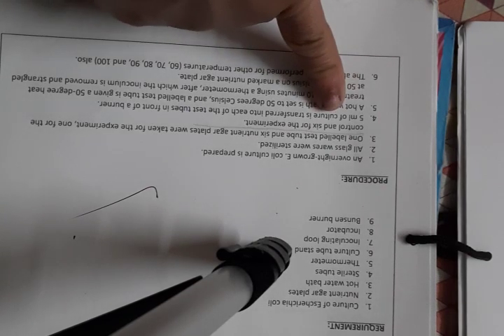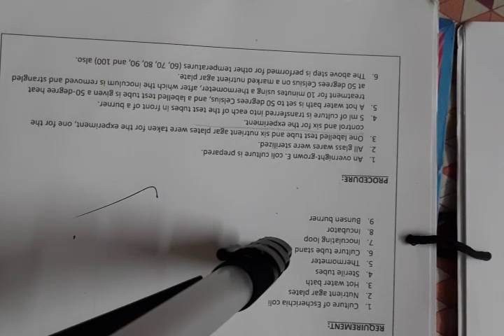And then here it is written that we need to give 5 ml culture, transferred from the test tube in front of the burner. So 5 ml of the culture, remember this. While here it is written burner, actually we would be using the hot water bath.